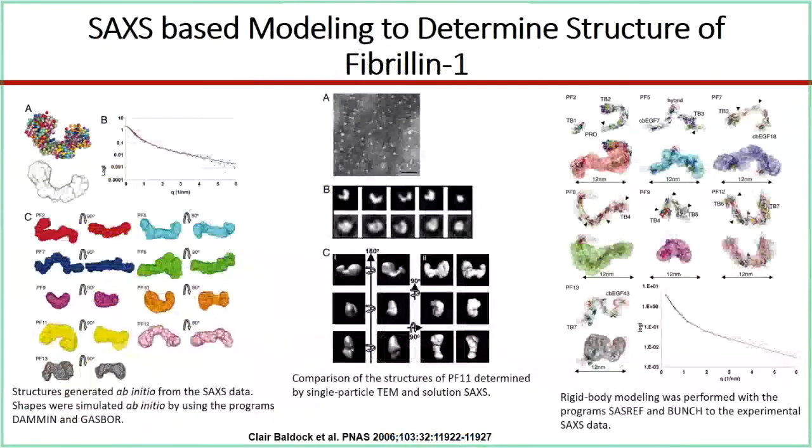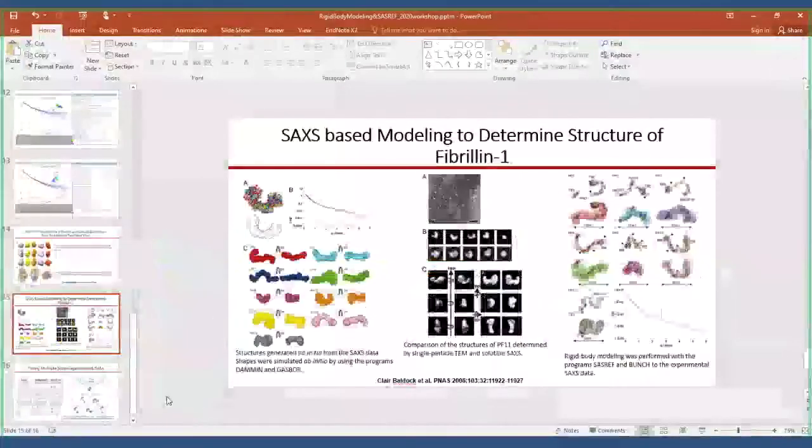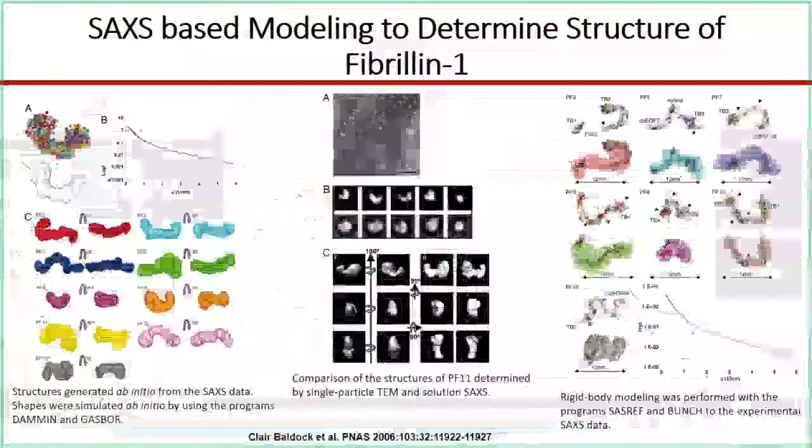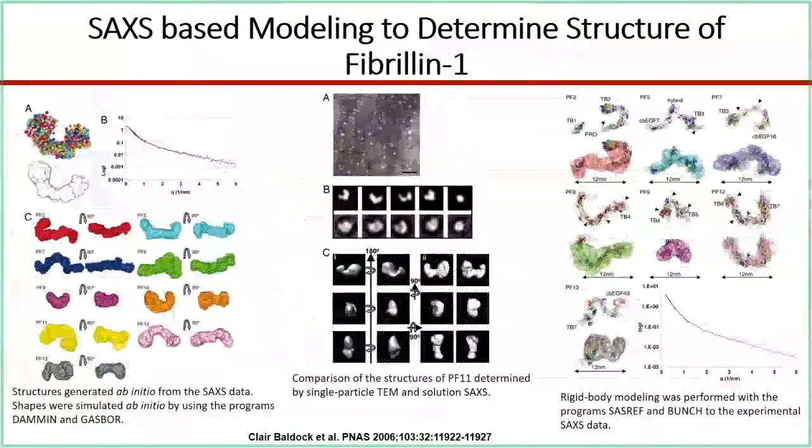There's a question related to that example, Srinivas, which is, how do you decide to enforce symmetry in DAMMIF? When do you make that choice? Well, in this case, crystallographically, they saw that there was twofold symmetry. But biochemically, they found that it was a tetramer, so it was a homodimer or a homotetramer.